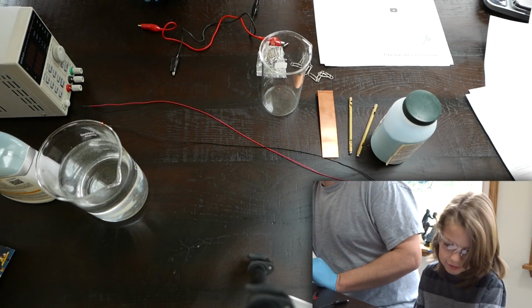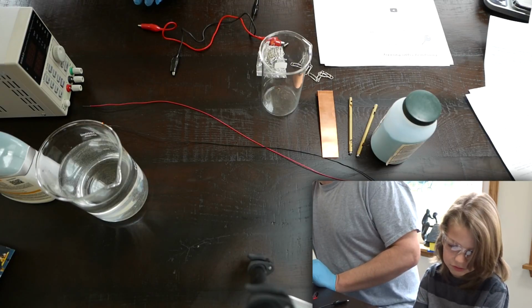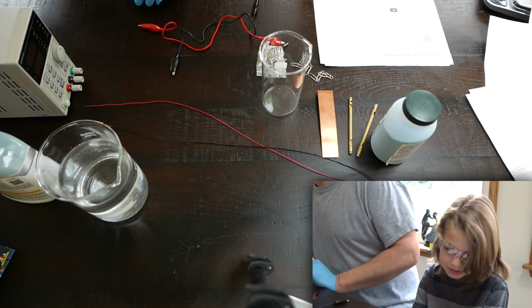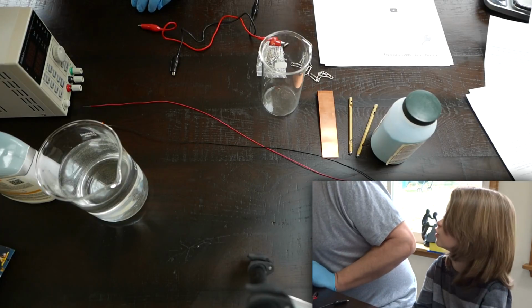Require specialized chemicals and equipment to make simple procedure that'll transfer copper to a brass key. Adult supervision and chemical safety equipment required.